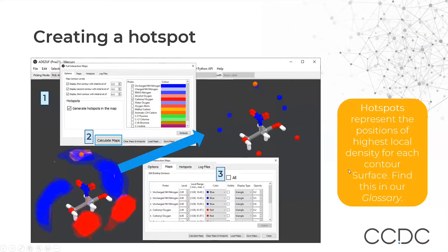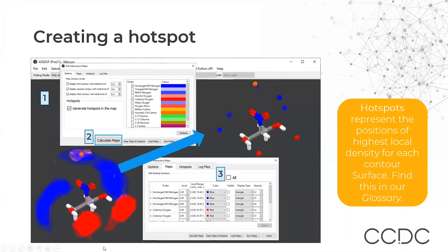You can also represent hotspots — the positions of highest local density for each contour surface — by ticking Hotspots before clicking Calculate Maps. If the display is too crowded and you cannot see the hotspots clearly, you can go back to the Maps tab of the full interaction map window and untick all, so you see only the hotspots rather than all the full interaction maps.